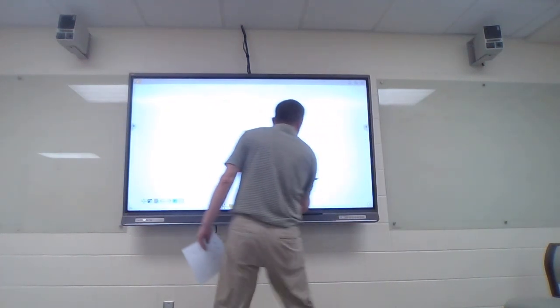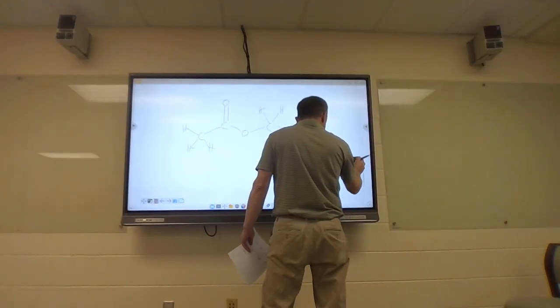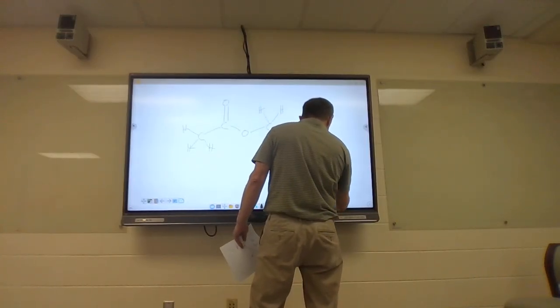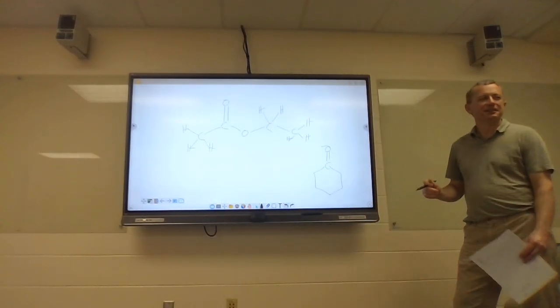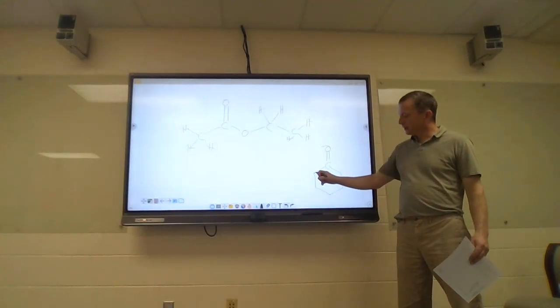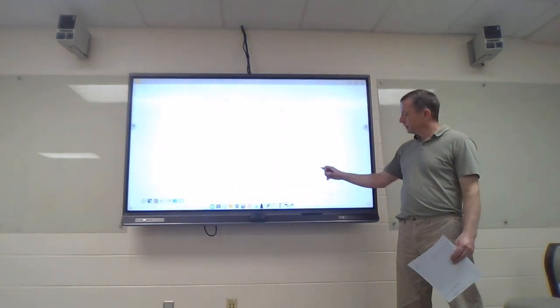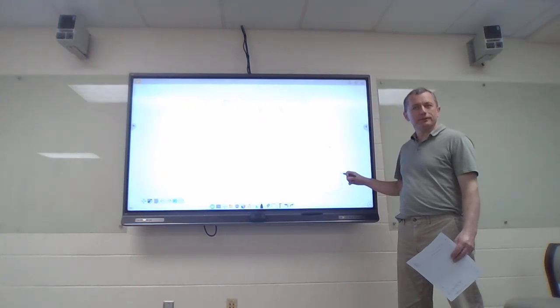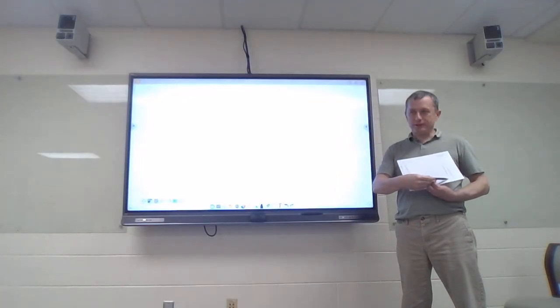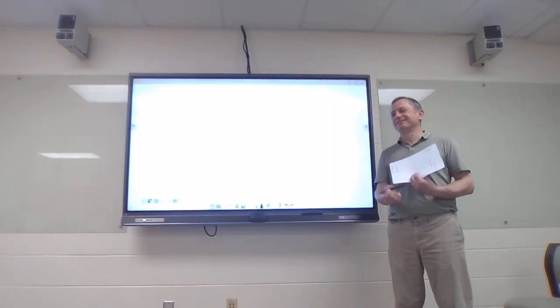Oh, you say. Okay, let's try this. Okay, there we go. If you can't make it symmetric, put a ring on it. Now, look at the hydrogens on this carbon, identical to the hydrogens on that carbon. Where would we expect chemical shift? Around 2, because they're next to a carbonyl. We see a peak integrating to 2, close to 2.